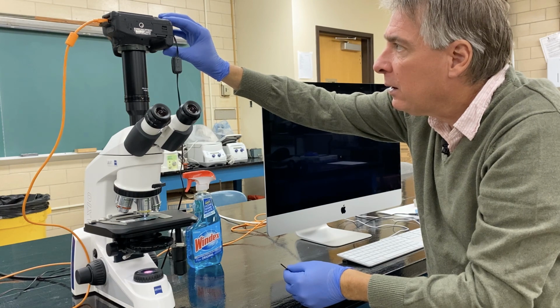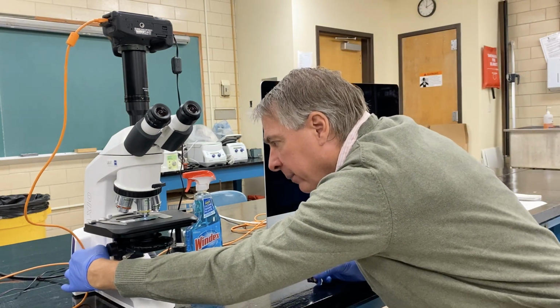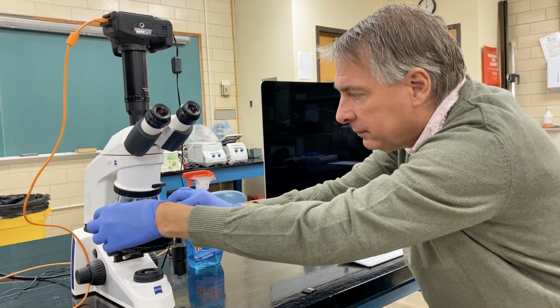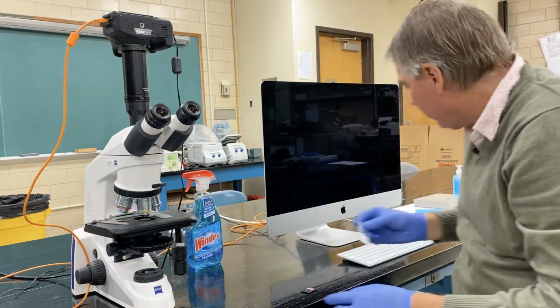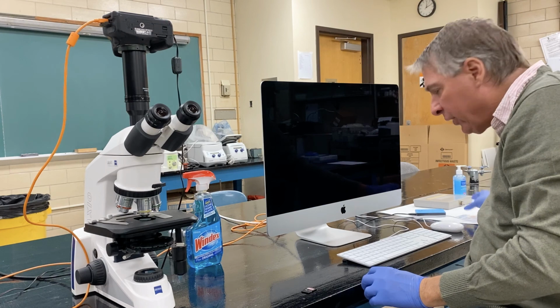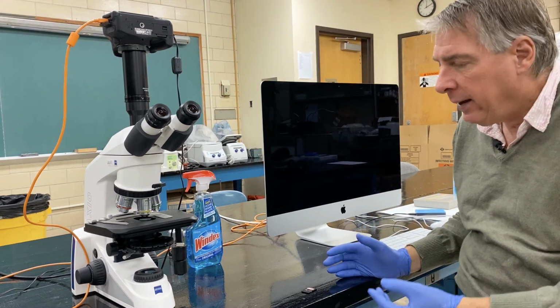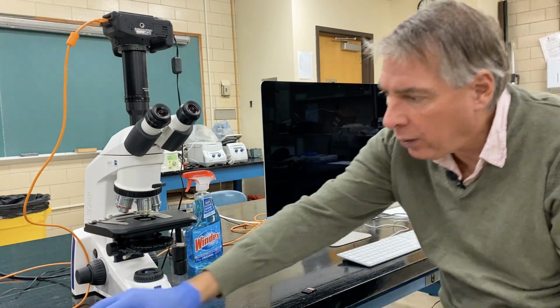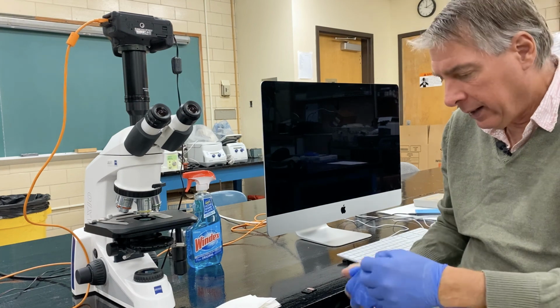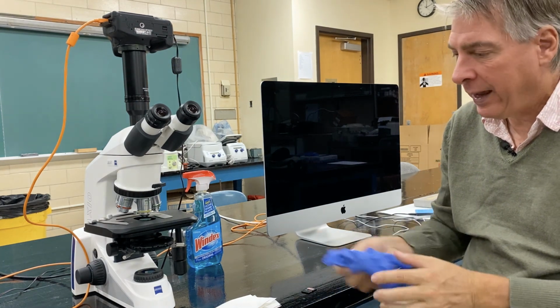Please close the door on the camera. Then turn off the power on the microscope. Pull out the micrometer slide and place that back in the slide box. Make sure that you take all of the notes that you need for your images, and finally you can throw away the paper towels and gloves and neaten up the area for the next person, and then remember to wash your hands after the lab's over.